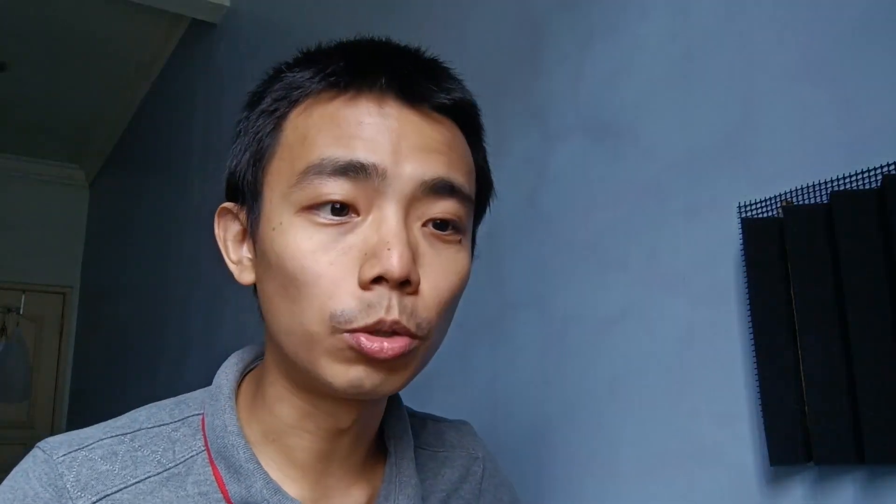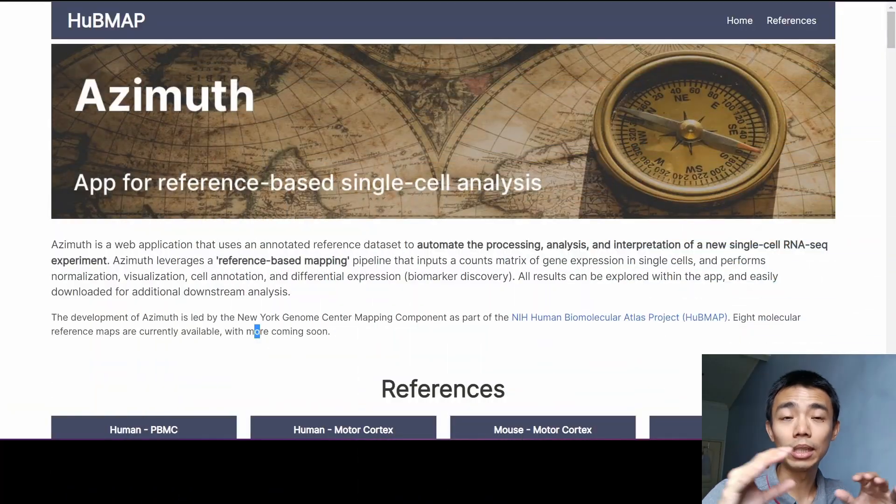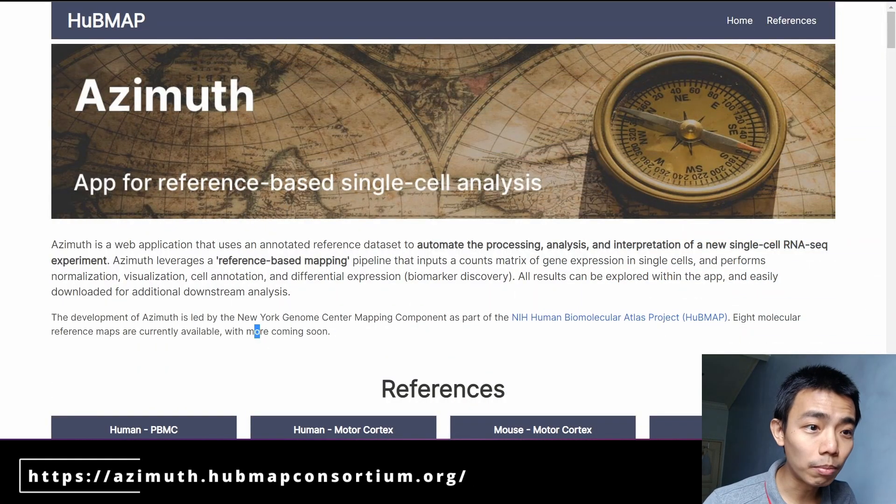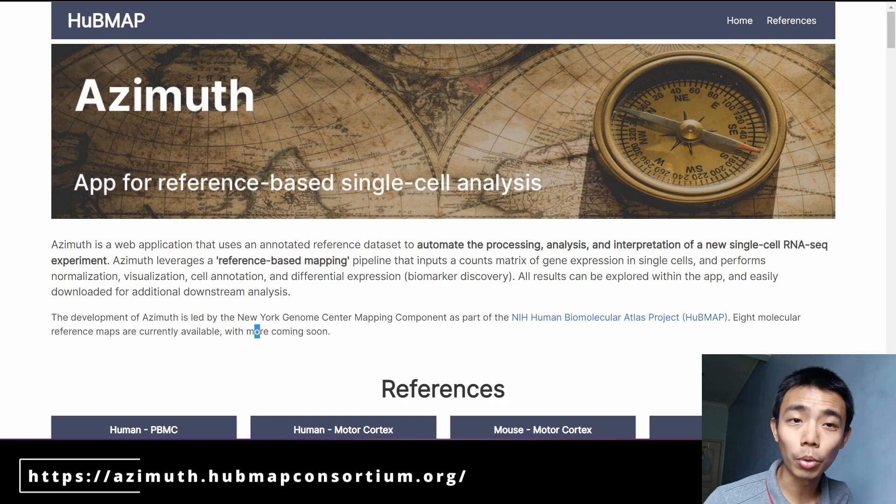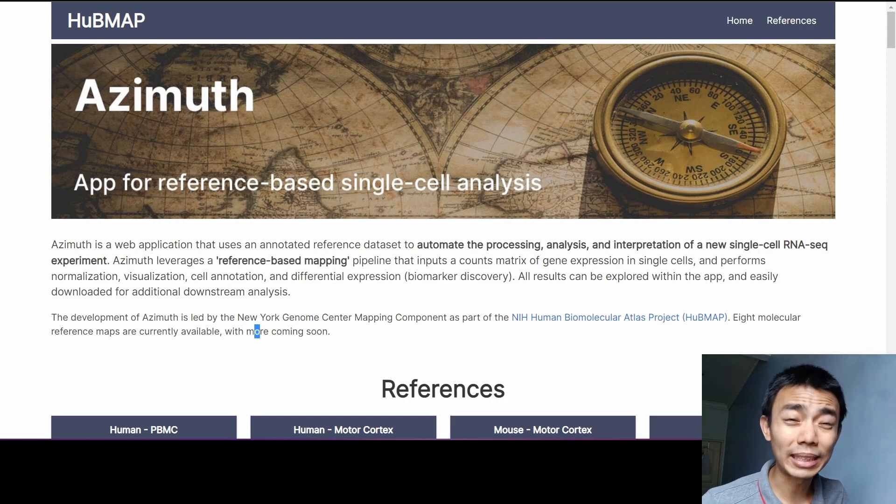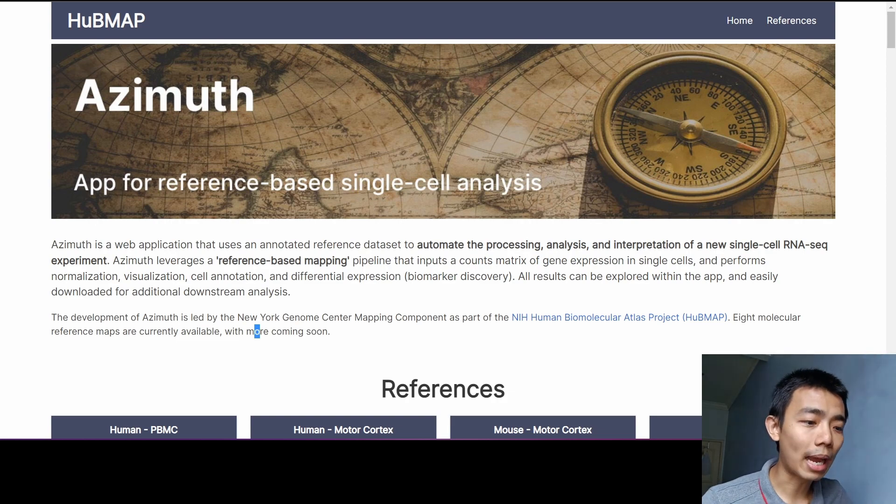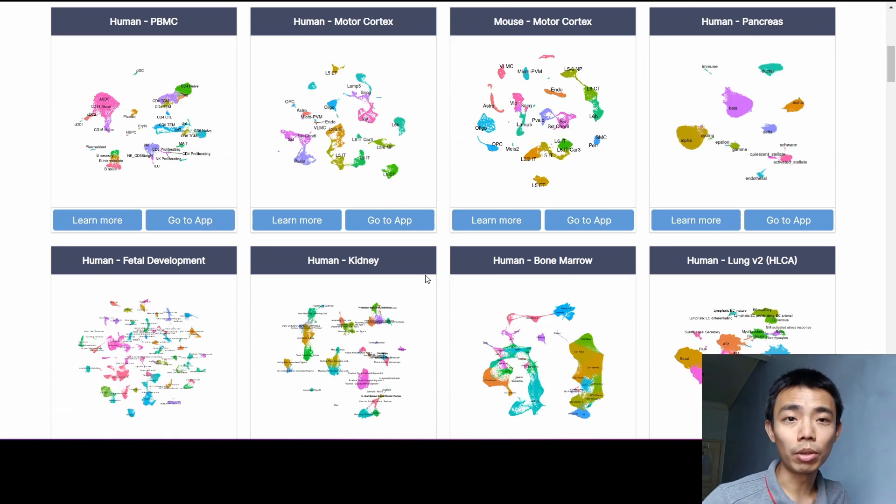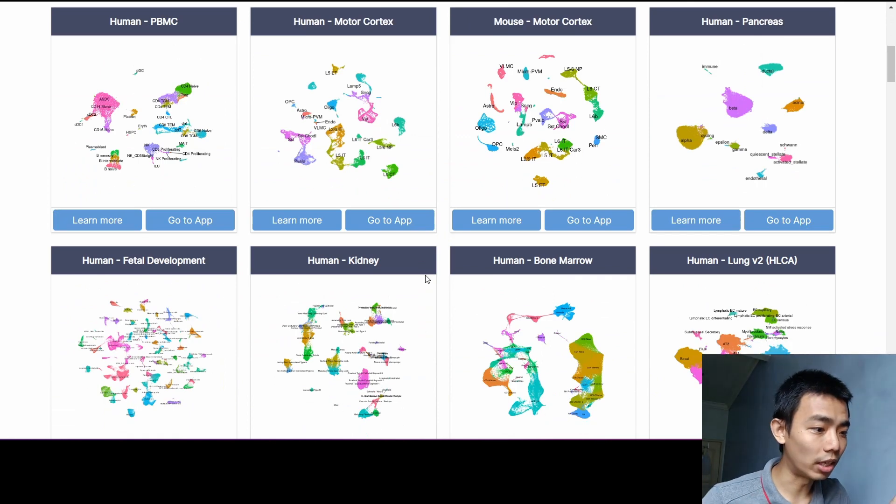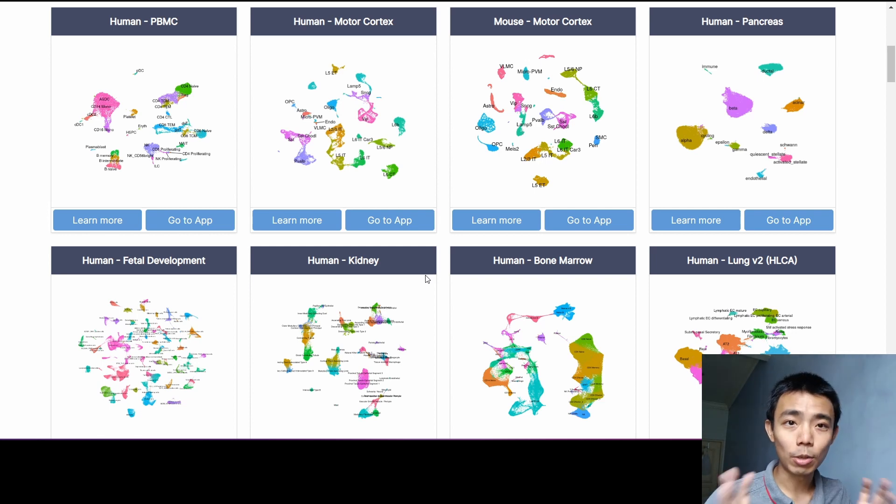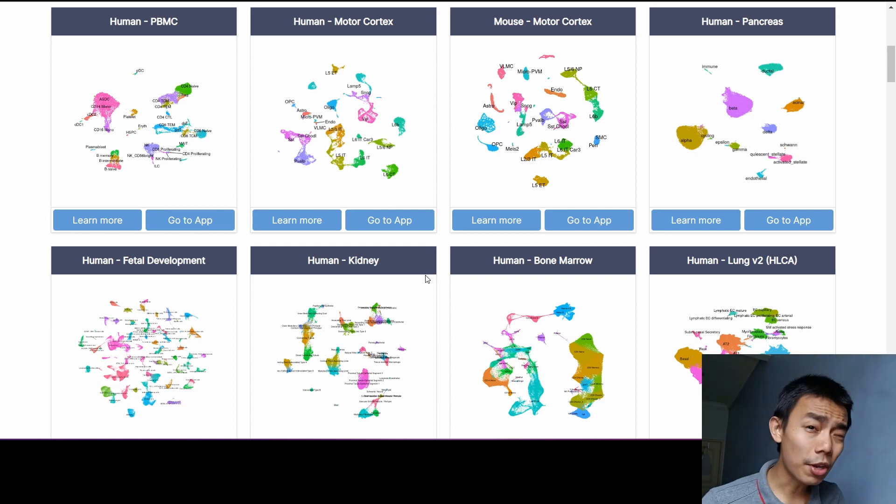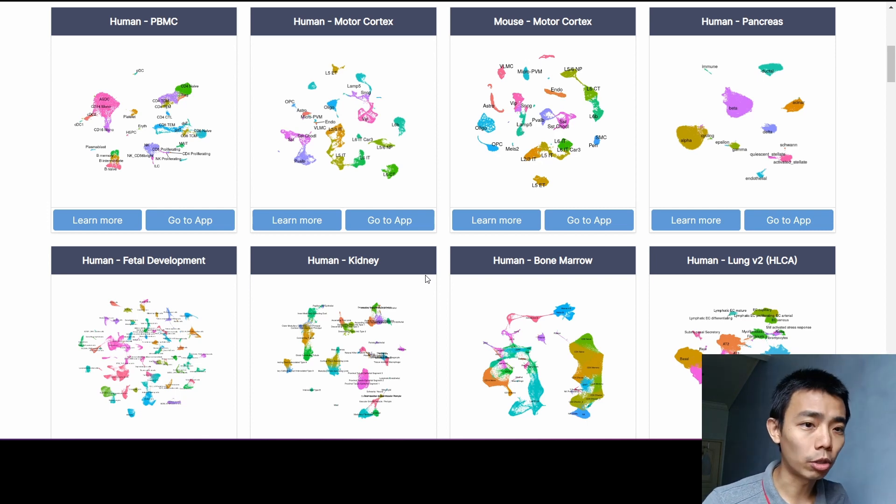So how you do that is you go to this website, which I'm going to link in the video description down below, called azimuth.hubmapconsortium.org and you'll be greeted by something like that. At this moment of time, there's eight different references that you can map to. So if your data comes from one of these human organs or mouse organs, you can actually use it directly. If not, you might need to wait a little bit. They're actually developing more according to their documentation.